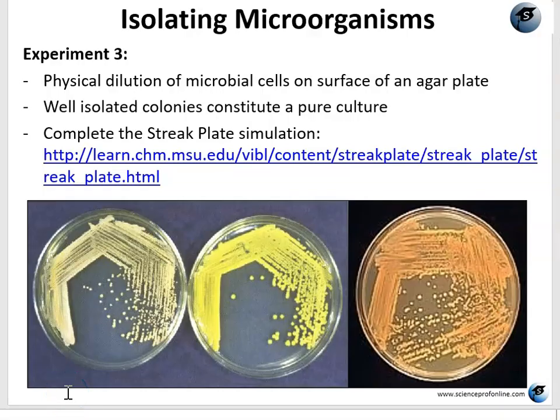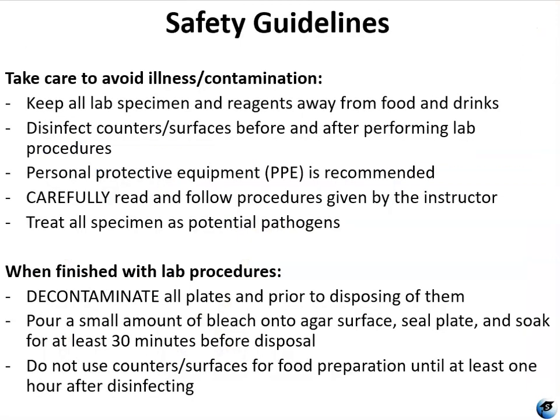So you're going to want to do that simulation, and you want to observe and record all of the procedural steps and the results so that you'll have them for completing your lab report. Very similar to Lab 1, you want to make sure that you keep your lab specimen and reagents away from any food or drinks. You're going to disinfect your counter or surface wherever you're working before and after performing lab procedures.